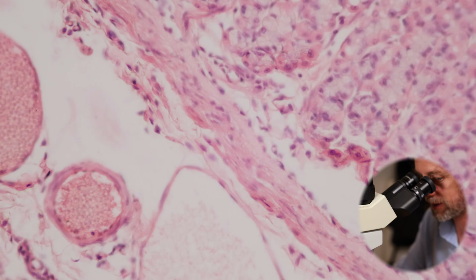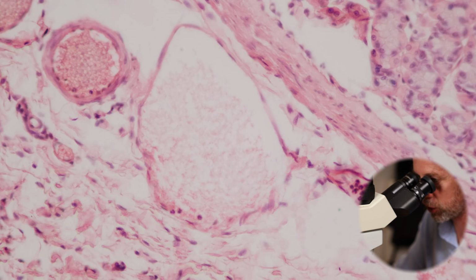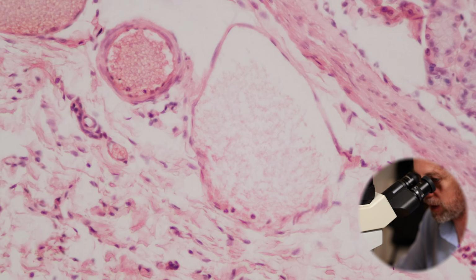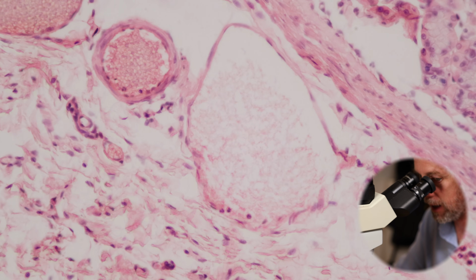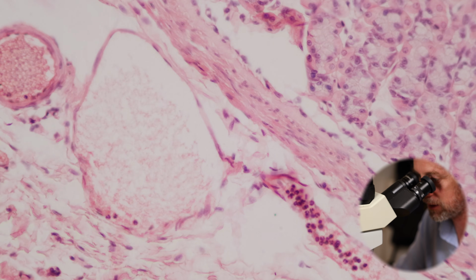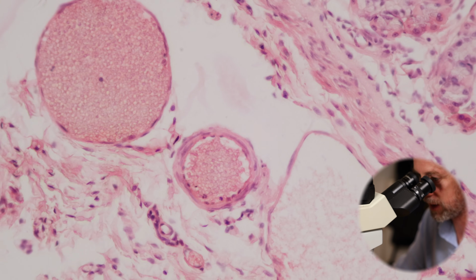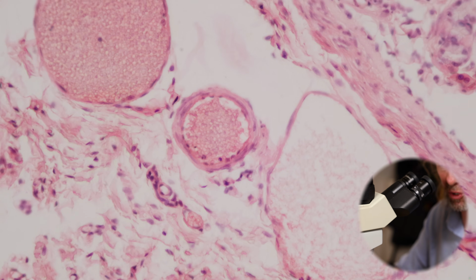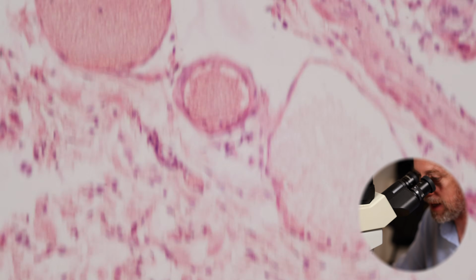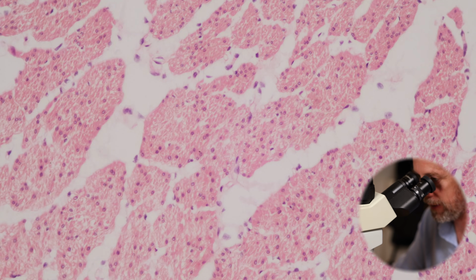And then look, right next to them down here, there's another little tube, another little circle with hardly a wall at all. It looks very much like the venule. So that must be a lymphatic vessel, right? Isn't that neat? So this is what the submucosa is then, where we'll find blood vessels and, like I say, nerves and all sorts. The supporting structures supporting the stomach, and then out here, there's the muscle layer.